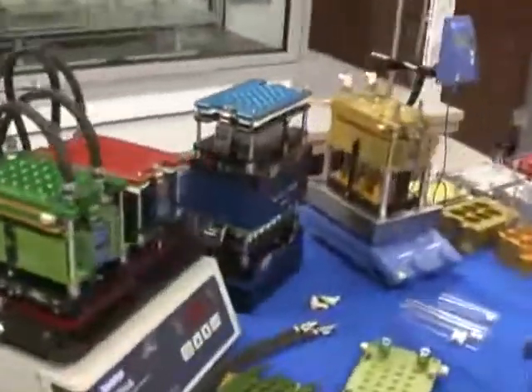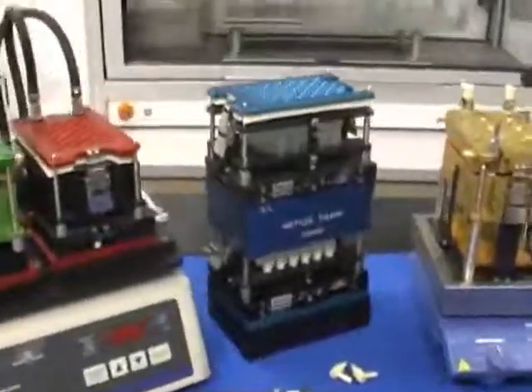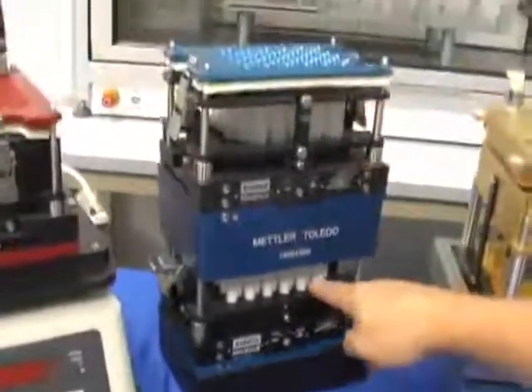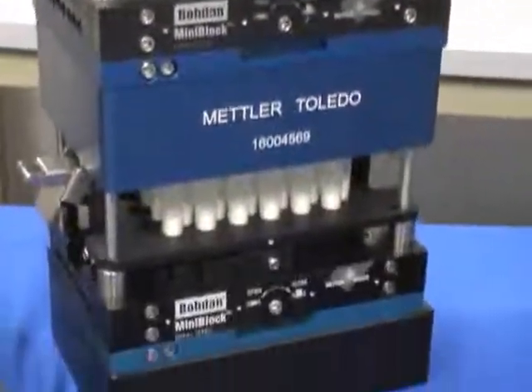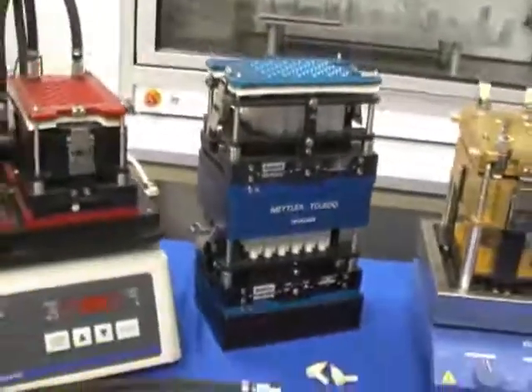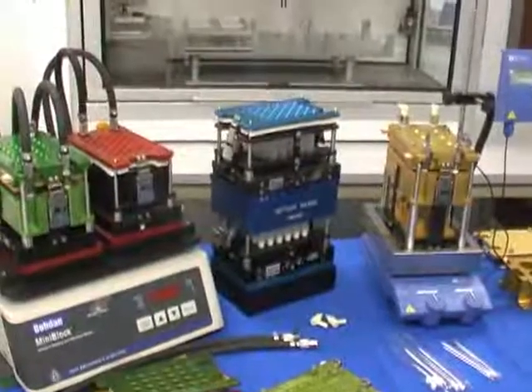One interesting facet of the mini blocks is the ability to stack one mini block on top of another. You can run your reactions in the top mini block and filter them down into a second mini block that could be loaded up with solid phase extraction sorbents, for example, to either extract or scavenge excess reagents or reactants.